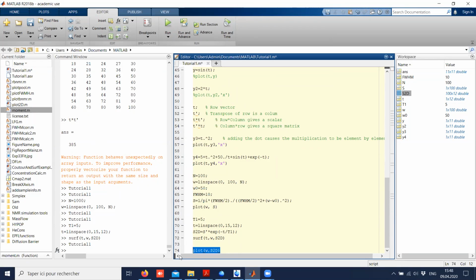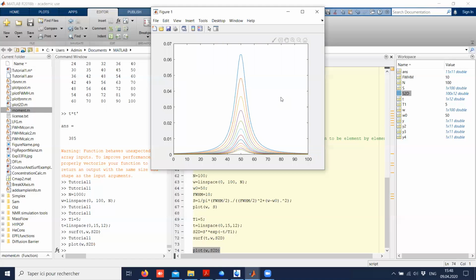You mean like this? No, not quite. You want to shift each spectrum vertically, so that they're all separated by a certain amount, and then also shift them to the side so they're clear to see.